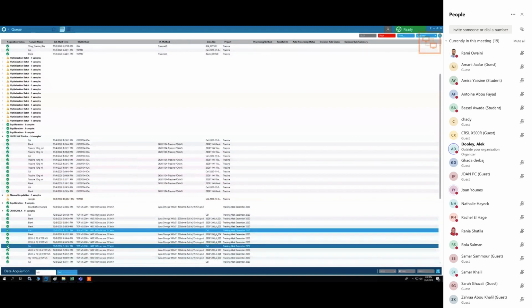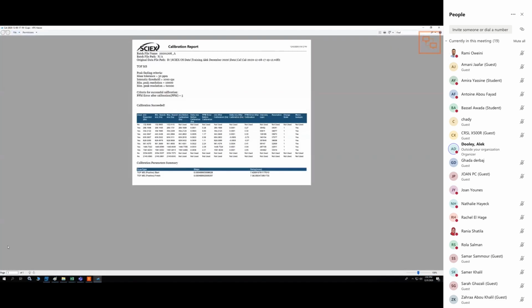Exactly. Here. Yeah, that's more reasonable. You see it's adjusting. That's more reasonable. Some of these are a little bit out of spec after just 1 hour.